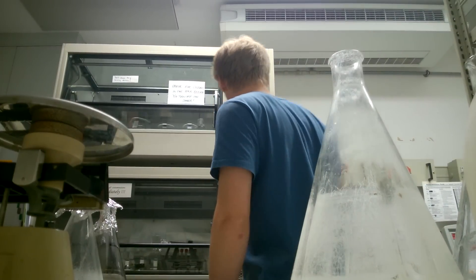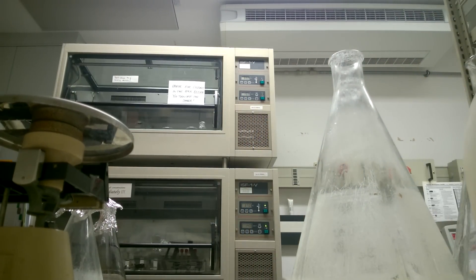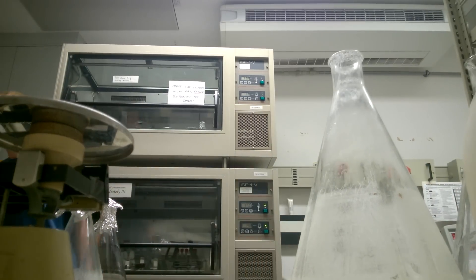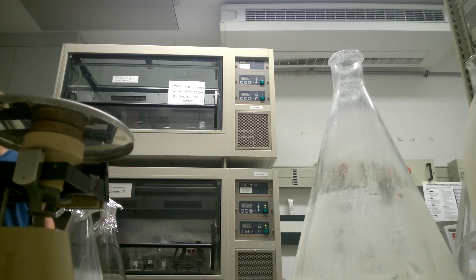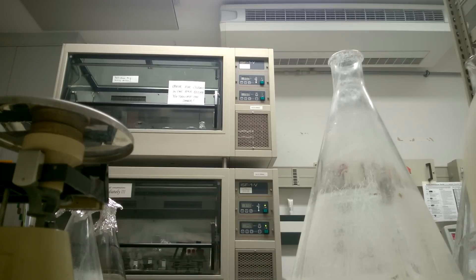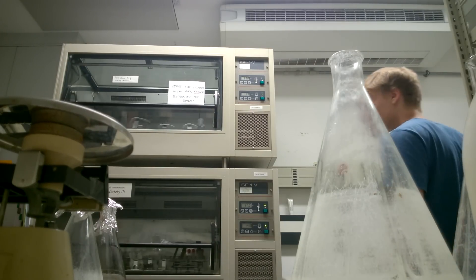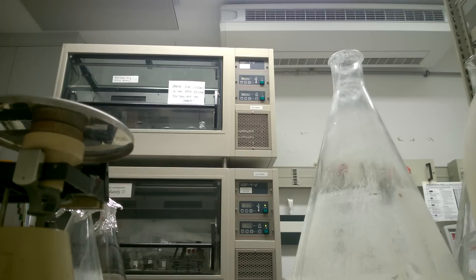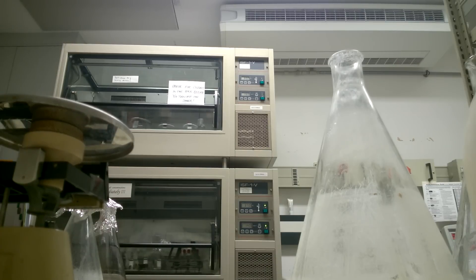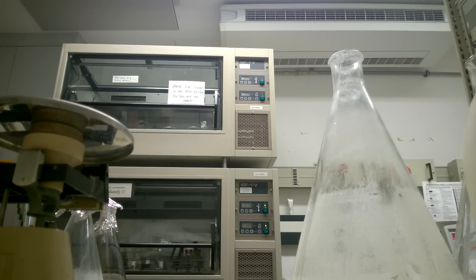Basically what you do is you have the cultures in the shaker overnight — six of these flasks with two liters each. Once they are grown to a certain optical density, a certain density of cells in the solution, you gotta harvest them pretty quickly. Otherwise they'll change states — if yeast cells grow too densely they actually change their metabolism a little bit, and you'd rather harvest them before they have the chance to do that to keep them in a more natural state.